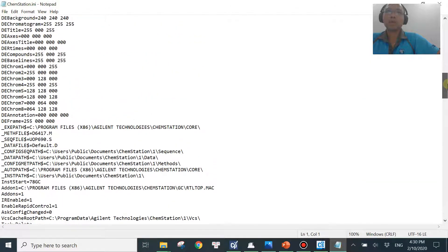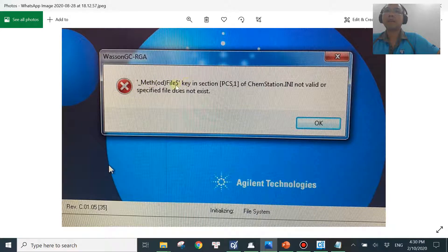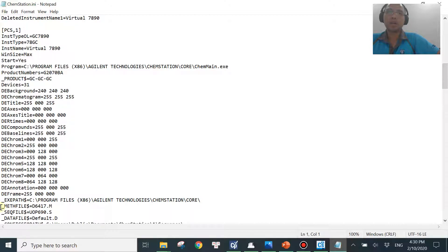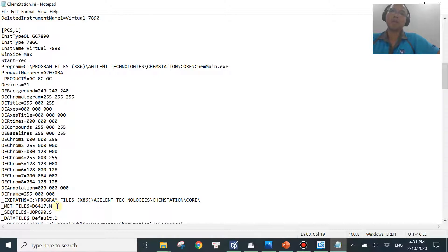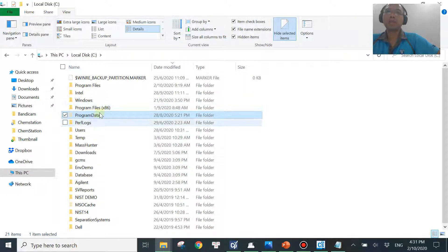Go to PCS1. The error message says 'method file dollar key is missing,' so you look for the 'method file' key under that section. The method the software is trying to look for — in my case — is d6417.m. If this method is missing from the method folder, the software will show you that error message. The reason could be that the method was moved, archived, or deleted.